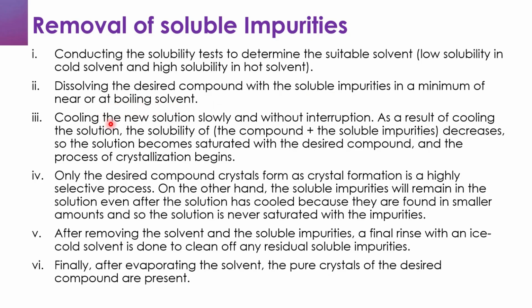After that, we cool the new solution slowly and without interruption. As a result of cooling the solution, the solubility of the compound and the soluble impurities decreases. So the solution becomes saturated with the desired compound and the process of crystallization begins.